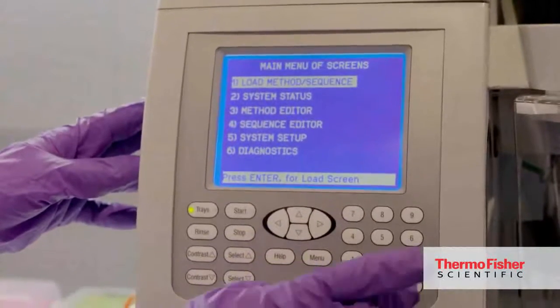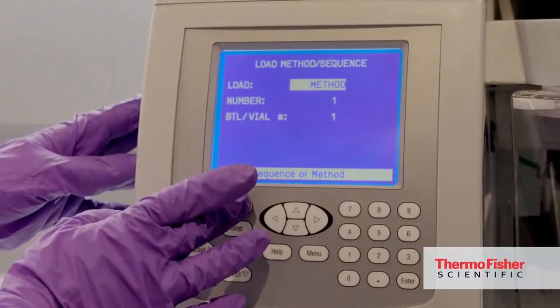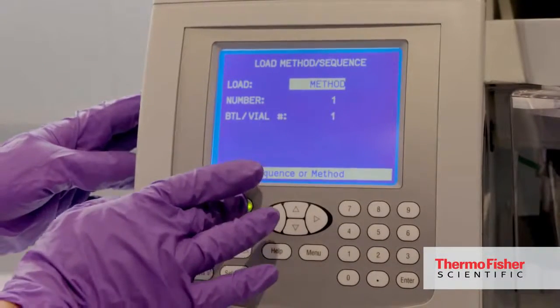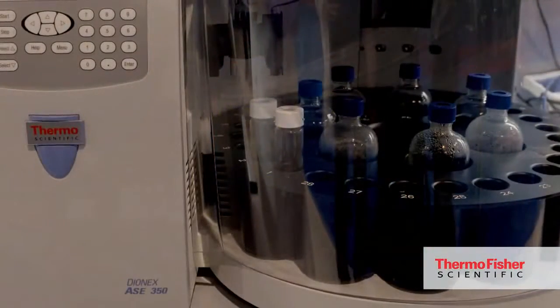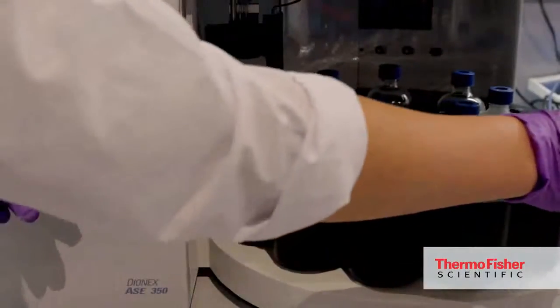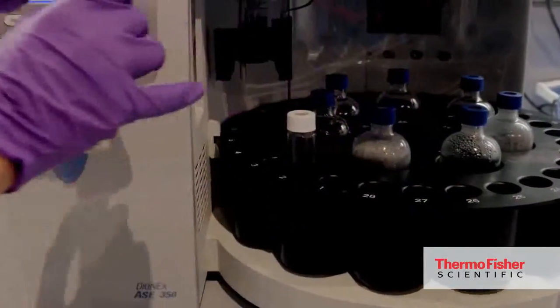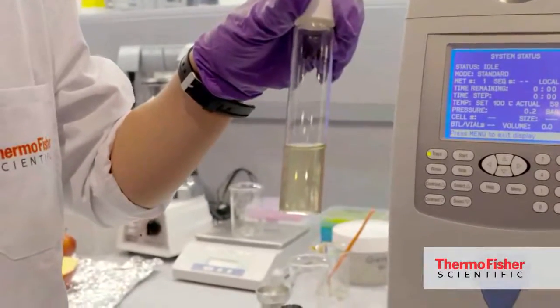Whenever it's ready, then we simply need to program the method and start the ready method by clicking on the Start button. So whenever the extraction is finished, you just simply remove the vial with the extract, which is ready to analyze or for further preparation steps.